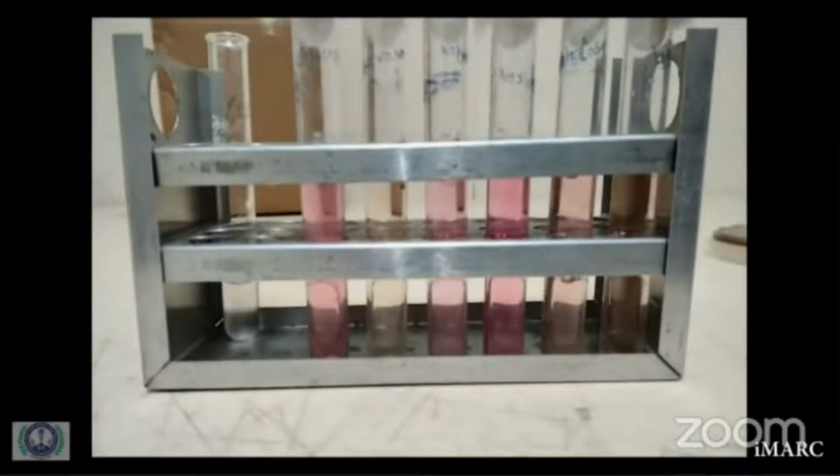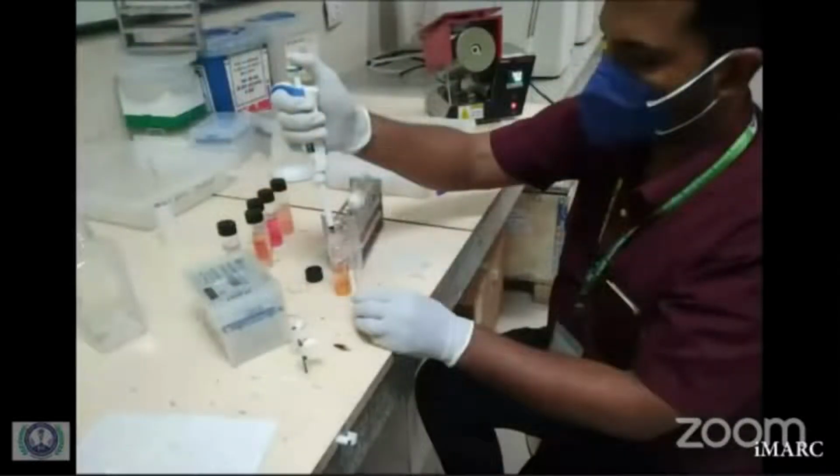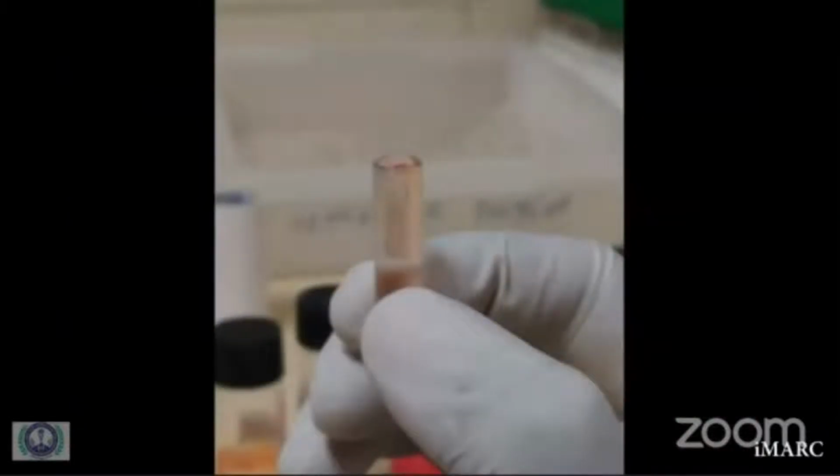Inoculate each carbohydrate broth with approximately 0.1 ml of the inoculum and incubate the tubes at 25 degrees Celsius for up to 1 week. Observations of the tubes must be made every 48 to 72 hours for production of gas. Please note that production of gas indicates fermentation.